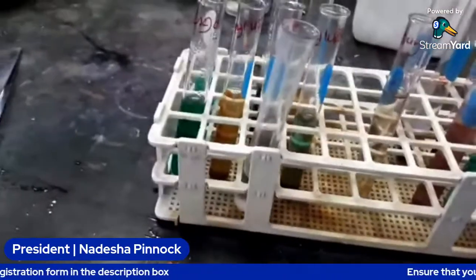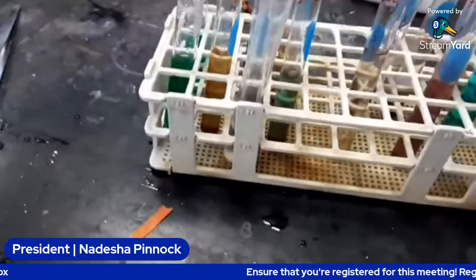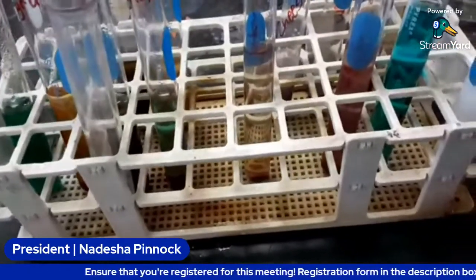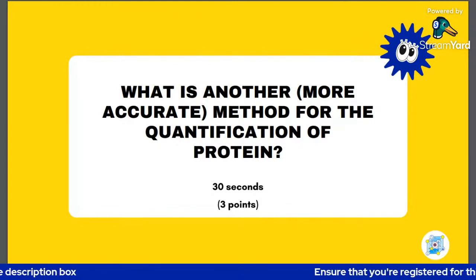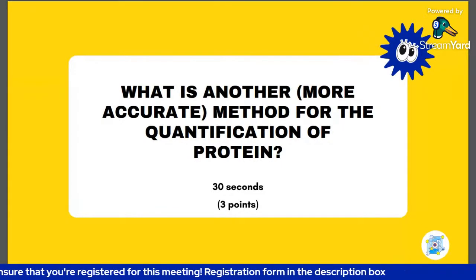The most common universal method of protein quantification is called the Bradford assay. You utilize the Bradford reagent. You react it with a standard protein called bovine serum albumin, or BSA, and use that to construct a calibration curve.